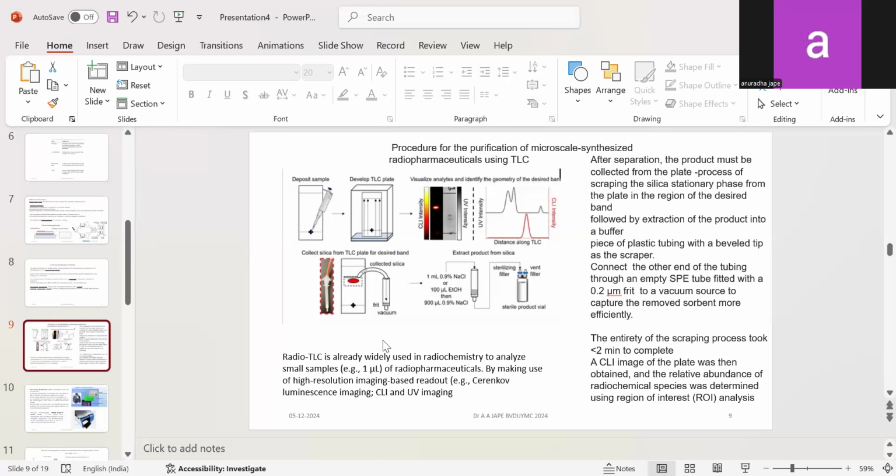Similarly, here the sample will be collected in the glass tube or glass sample holder, and to that you are going to add the solvent system and mix with it. Of course, what about the support material? Is it not present in it? Yes, it is taken care of, because when it is entering the collector tube, there is a filter placed which is going to selectively remove the support materials based on the molecular size, particle size. And mostly what you get in the analysis glass tube is the pure analyte.